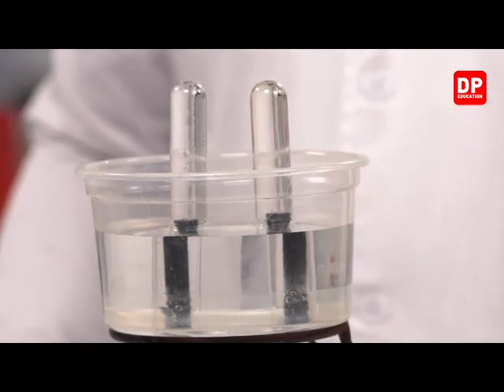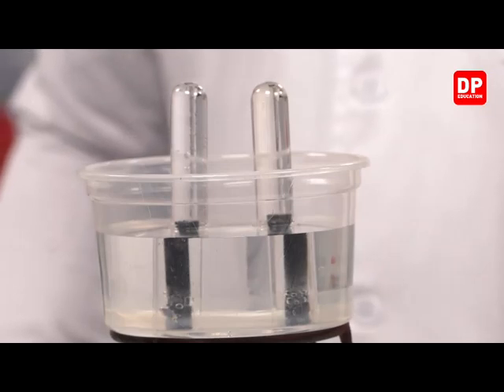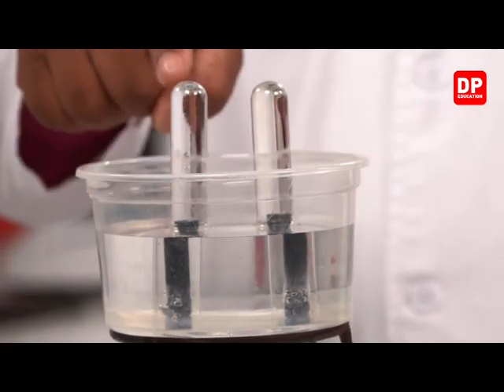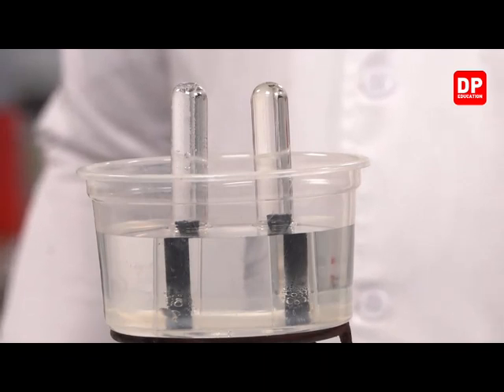So we have to keep this system for a while, and we have to collect the two gases that are going to be emitted from these two terminals. As you can see here, gas bubbles are now rapidly coming out from the negative terminal. So we have to collect these gases, my dear children. So we have to keep the setup for a while.